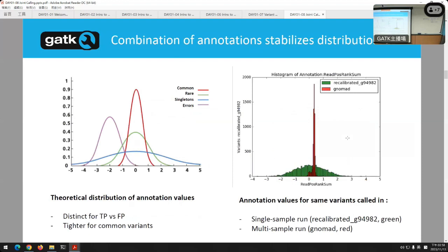And there are a couple of different annotations that actually help there. So, for instance, when you look at just one sample or a couple, you can actually see that there's a distribution of, for instance, common variants and the rare ones. It peaks here, and that's actually okay for a good one. But when you have a lot more samples, something that looks like it's rare, it looks like it's peaking, those will start to actually even out some. If it looks like it's rare in one sample, looking at a large enough population, it might take on the distribution we'd expect to see.